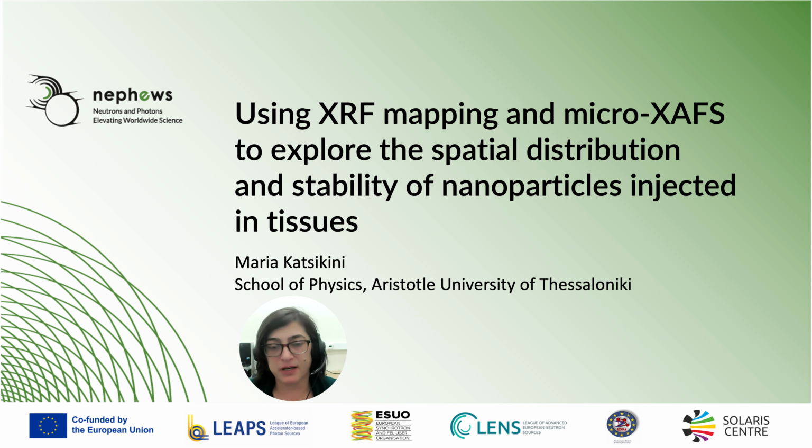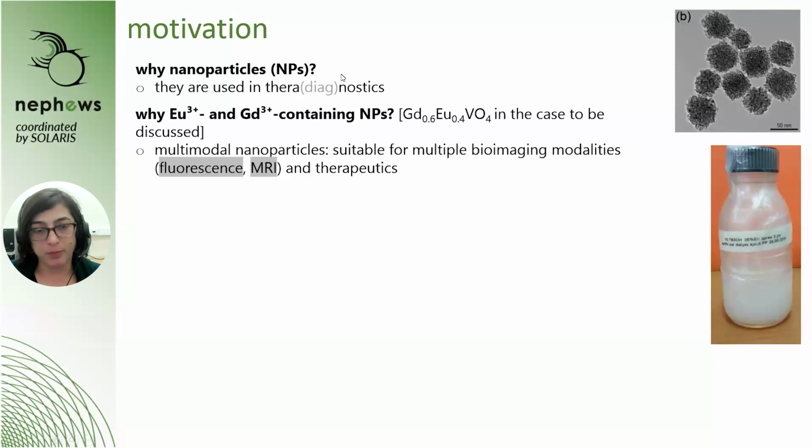And I'm going to present a case study on the use of X-ray fluorescence mapping and X-ray absorption fine structure spectroscopy for the investigation of the spatial distribution and stability of nanoparticles injected in tissues. Why studying nanoparticles? Because they are used in therapeutics and diagnostics. These two terms are combined in the new term theranostics.